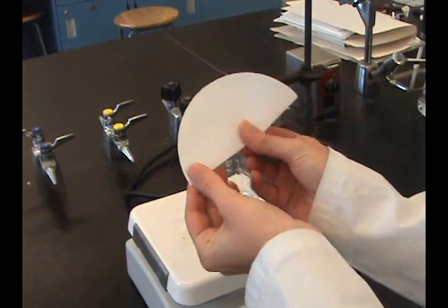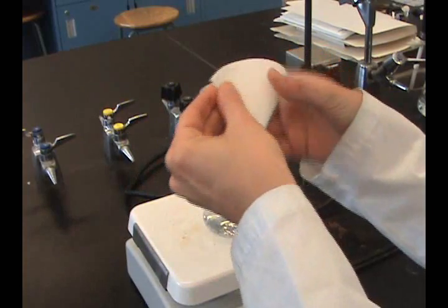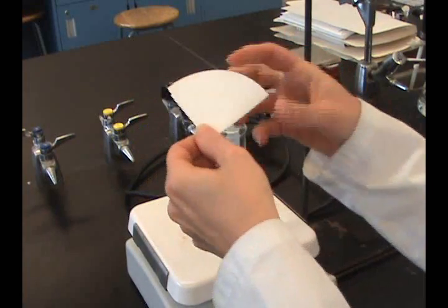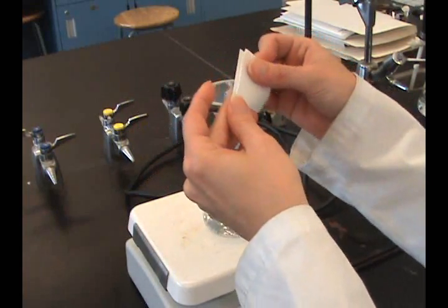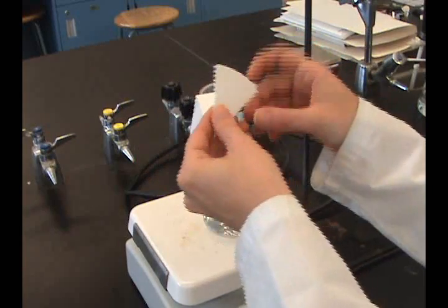Fluting is done by folding the filter paper in quarters, as in regular gravity filtration, but folding each quarter and then each eighth to make a fan.